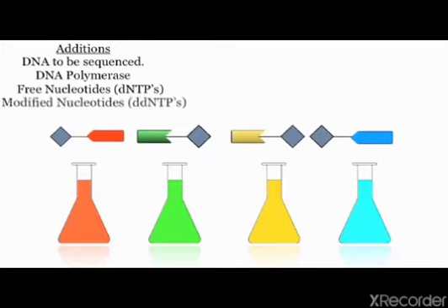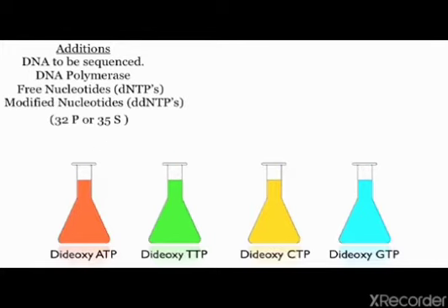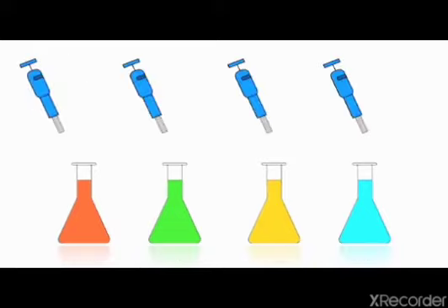Modified nucleotides, or ddNTPs, are then added to the reaction mixtures. Only one type of ddNTP is added to each reaction mixture. Chain termination occurs after the addition of a ddNTP due to the fact that there is no OH group available to attack the next dNTP. The DNA must now be separated on size.